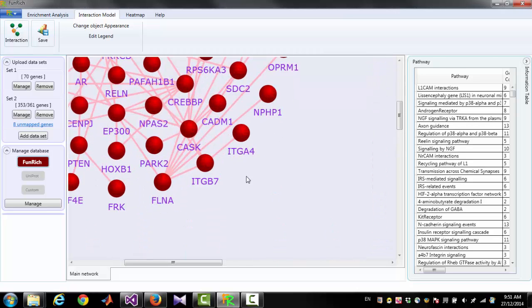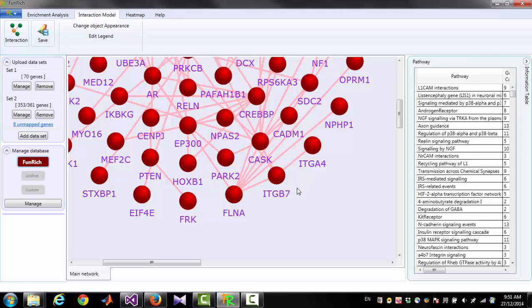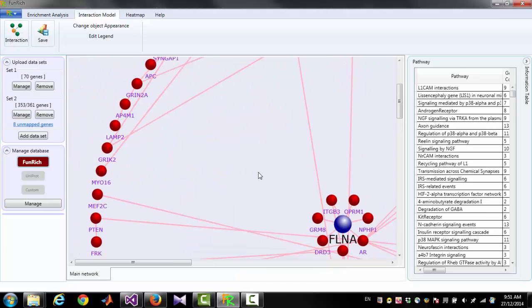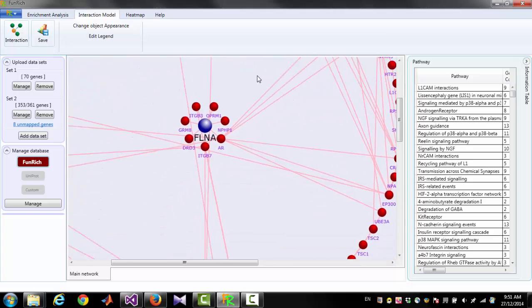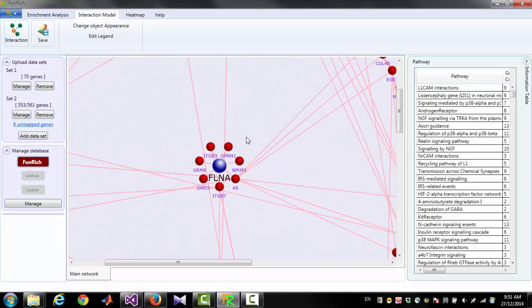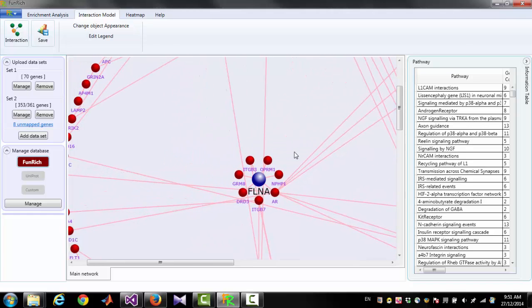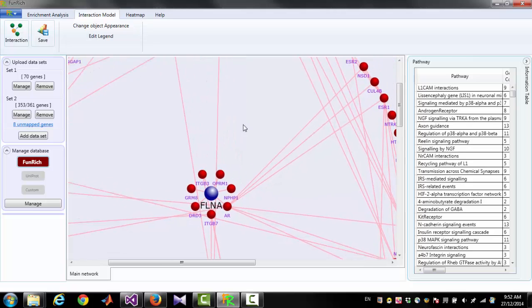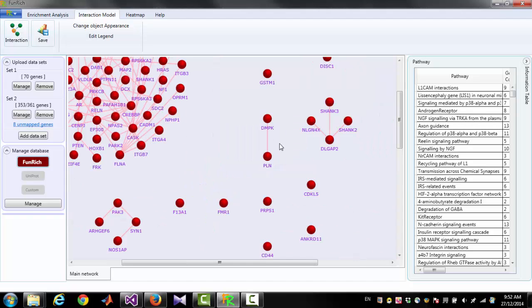If you want to focus on a particular gene of interest, right-click on that node and click 'Focus This Node'. This will rearrange the diagram so your selected gene will be at the center. You can go back to the original diagram by right-clicking on the empty space and clicking 'Refresh with No Focus'.